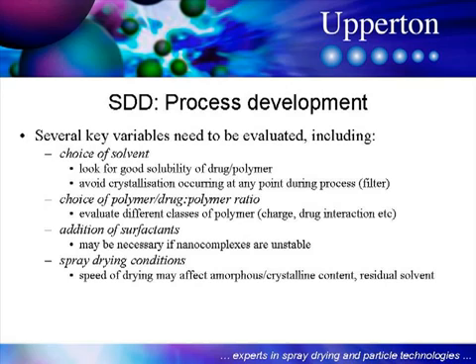If the polymer drug spray dried dispersion doesn't give us the properties that we require, it may be necessary to add a surfactant into the spray drying process to improve the solubility further.